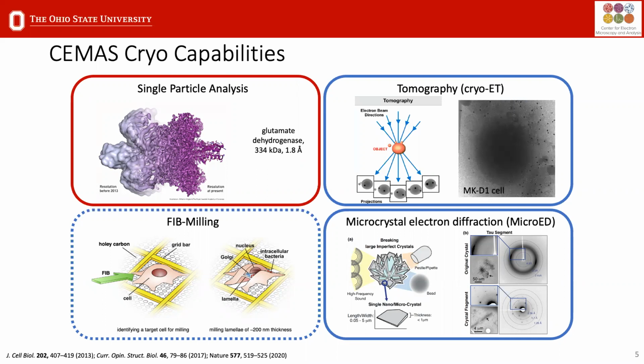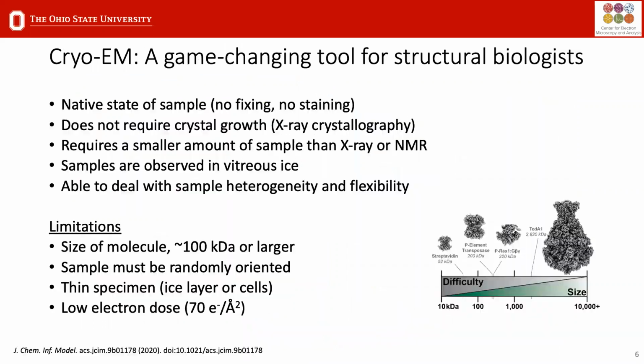So it's not just single particle analysis, but that's the main focus for today. As a brief reminder, I'm sure everyone here is aware of how influential Cryo-EM has become in the last 10 years, especially for structural biologists, and of the advantages of this technique versus, say, X-ray or NMR.